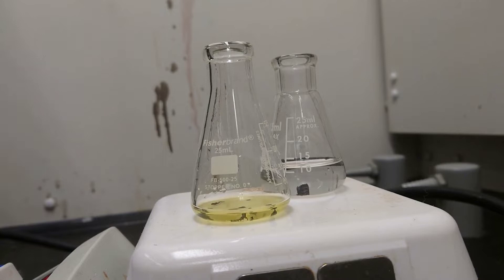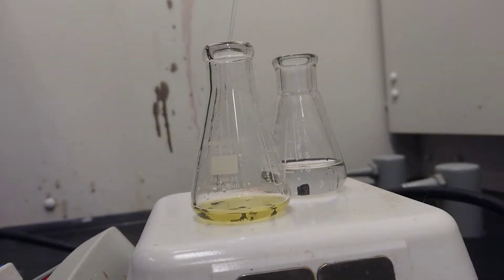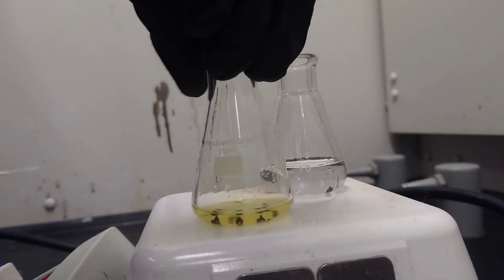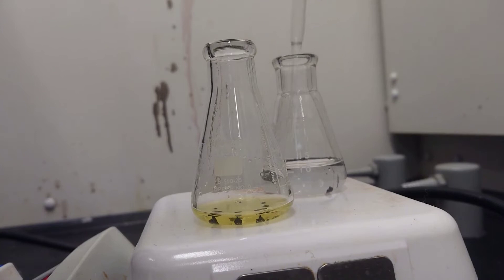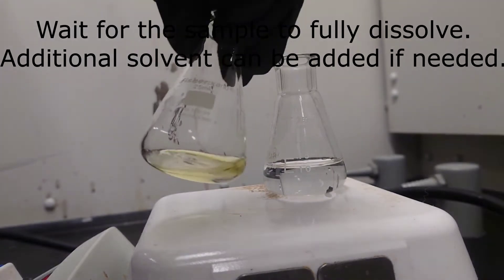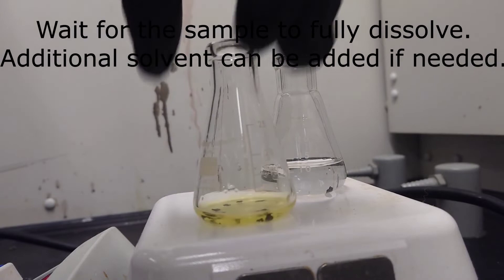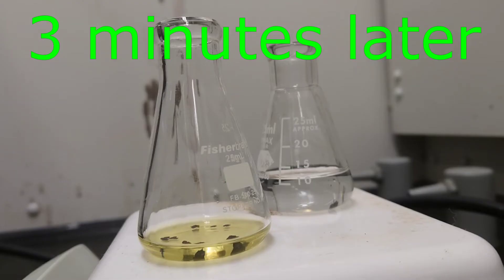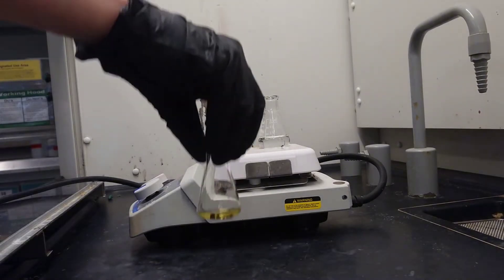Slowly add boiling hot solvent until the sample fully dissolves. Once the sample is fully dissolved, remove the Erlenmeyer flask from the hot plate and allow the mixture to cool to room temperature.